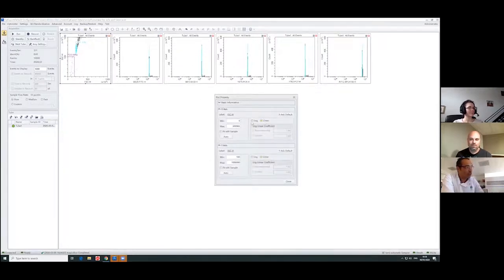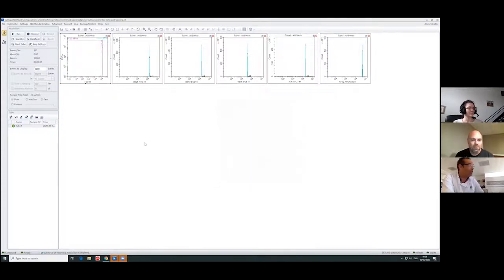So from linear, you change this to logarithmic scale. Okay. Ooh. Now your beads are out there. These are around 2.5 microns. You're looking for something far smaller than that. But if you see here, there are a lot of things that you don't see. There's one point here that we are cutting the signal. You don't see anything below that. And definitely there are things below that.